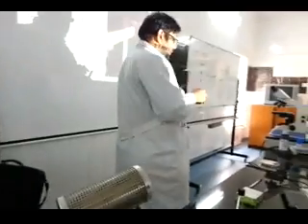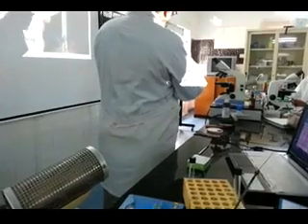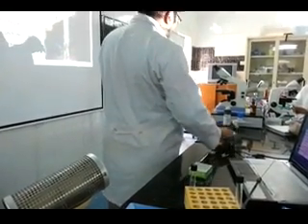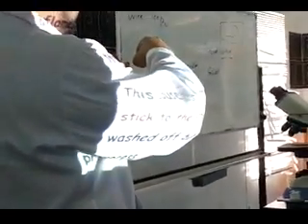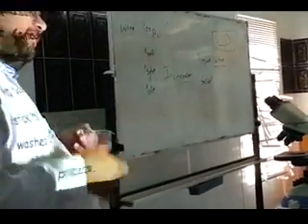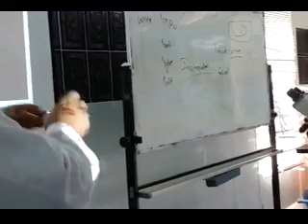For example, this is my slide and I write first thing here, this is sample A. Why? Because I want to know where I am putting the bacteria. If I put the bacteria here, and then I forget, I'm talking and my mobile is ringing, and then I do like this, and I put color stain here, no stain. Or I forget, and the next step, that is heat fix, I do like this, I burn all the bacteria. So I have to remember which side I am putting bacteria.